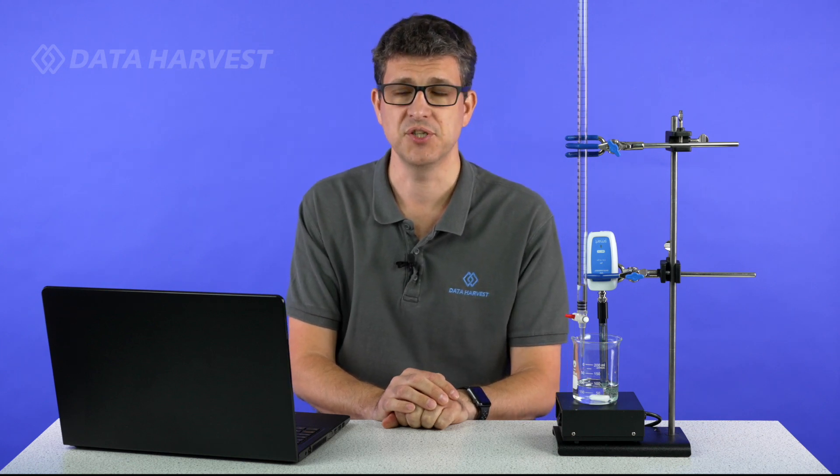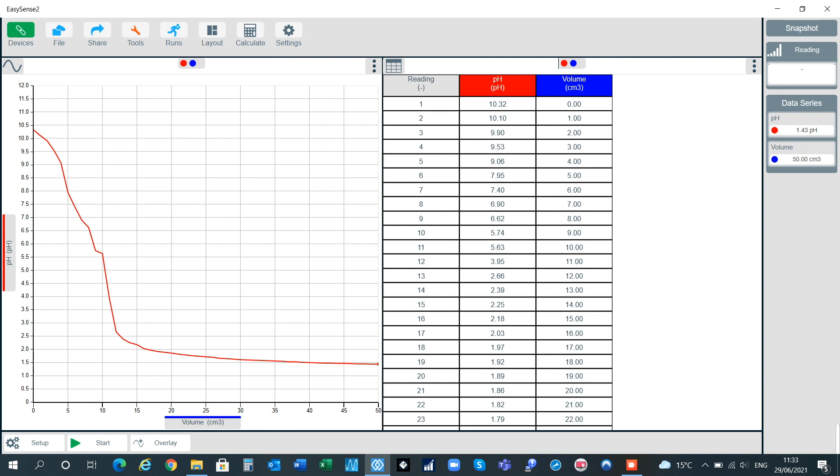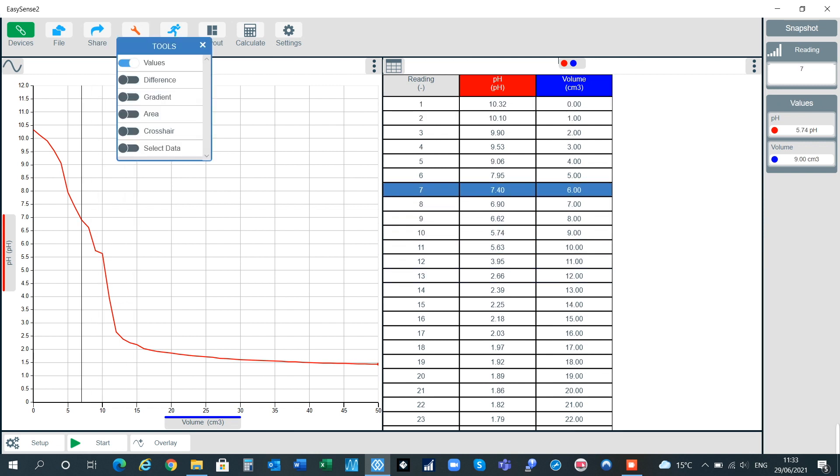You can now save your software, save it to CSV or save it as an EasySense2 file, whatever you wish to do with it. You can also go into the tools section here, have values, and you can see how all of that works on there as well. If you want to see more on our secondary academy, please visit the Data Harvest website on data-harvest.co.uk. Thank you.